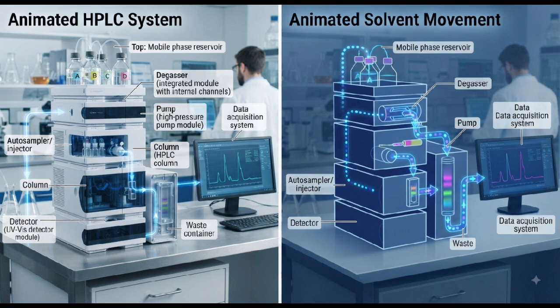What is HPLC? HPLC stands for High Performance Liquid Chromatography. It is one of the most commonly used analytical techniques in pharmaceutical quality control laboratories. An HPLC system separates components present in a sample and allows us to identify and quantify those components.